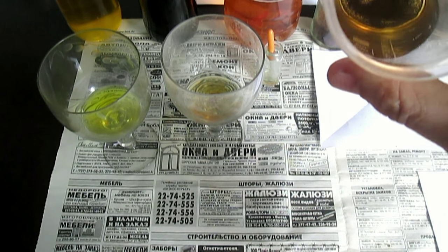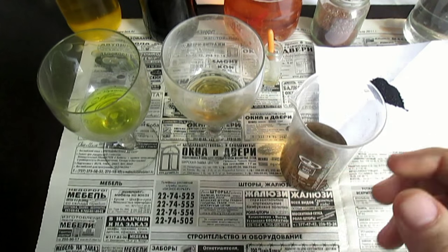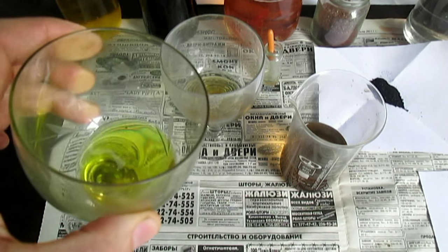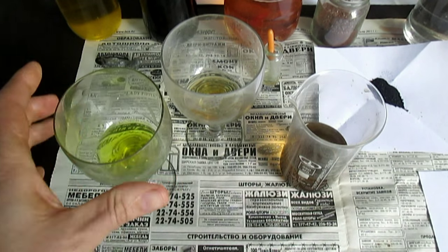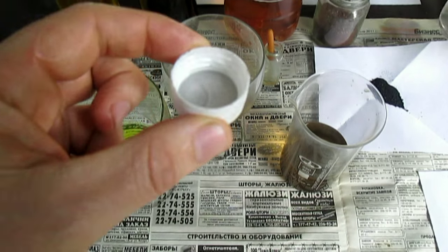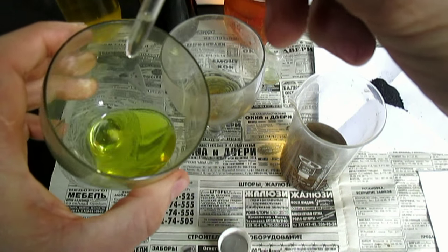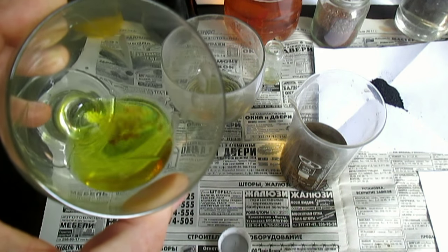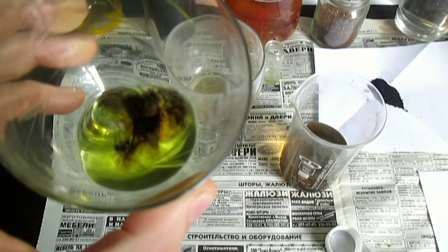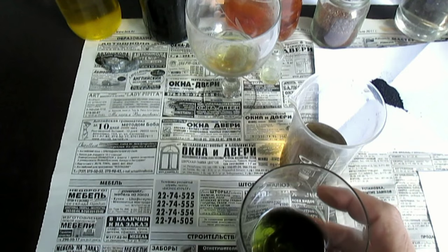Осадок почти выделился, пузырьки почти не выделяются. Из этого раствора я также выделю золото. А здесь шелуха вся растворилась — стандартный раствор, видите, зеленоватый, желтовато-зелёный. Могу, кстати, быстро провести реакцию и убрать этот раствор уже на хранение. Берём капельку олова — стандартный царско-водочный раствор. Сразу нормально реагирует, разумеется, потому что это стандартный раствор. А здесь ничего не будет протекать.